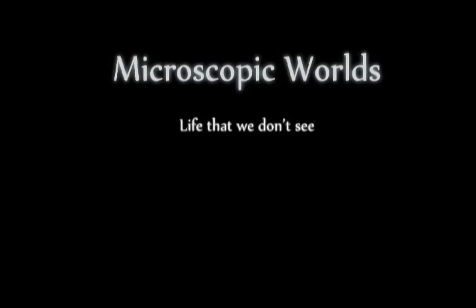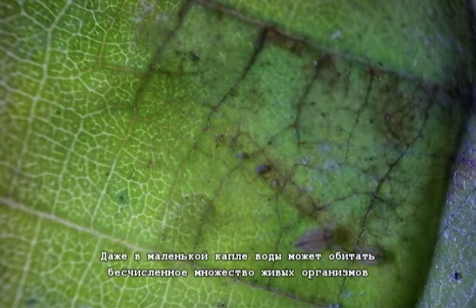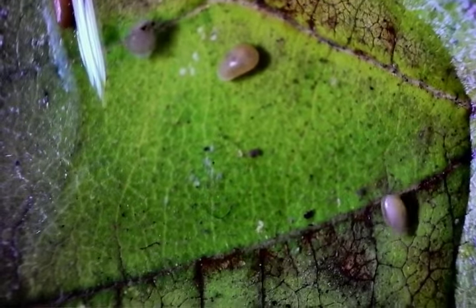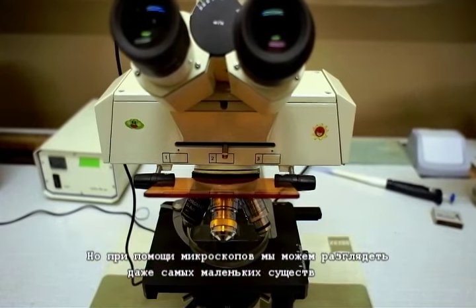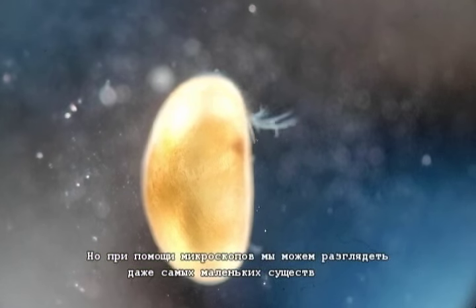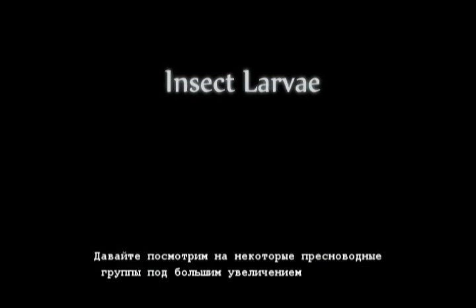Even a small drop of water can contain countless animals. Just a few are visible to the naked eye, but with the help of microscopes we can reveal details of the tiniest creatures. Let's take a look at some common freshwater groups under high magnifications.